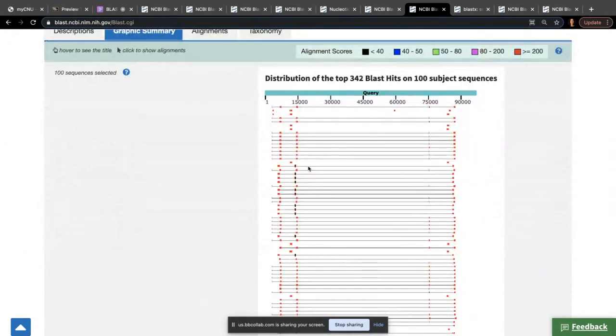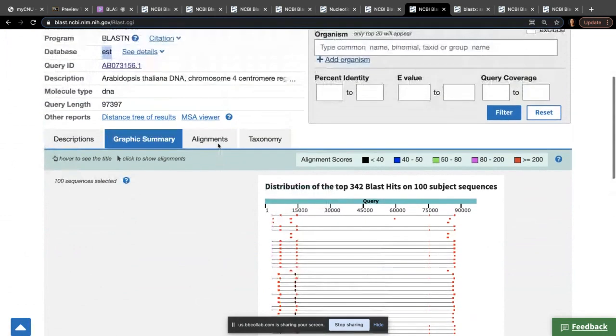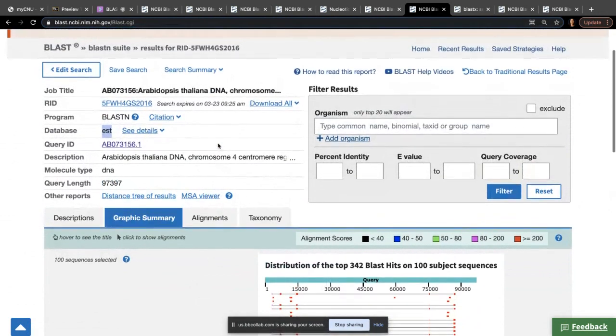And these are all connected, not because they are the same gene, but because they were the same collection of ESTs. So I was like, okay, this is kind of misleading. It says pooled cDNA populations. That just means that they sequenced all that and they all came from some pool, but not necessarily from the same gene. But the point of me showing you this screen is to tell you that EST is also a database you could use to find if there is a match.